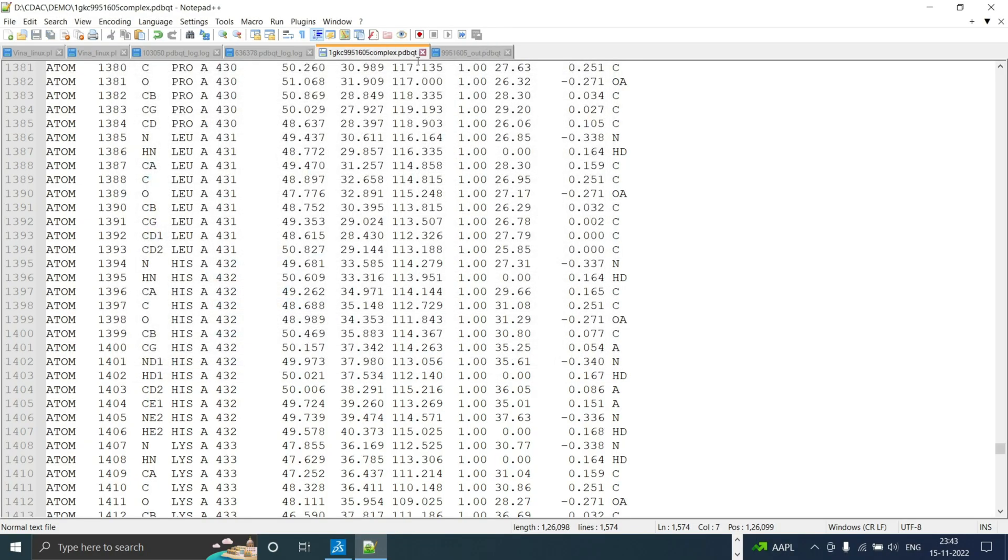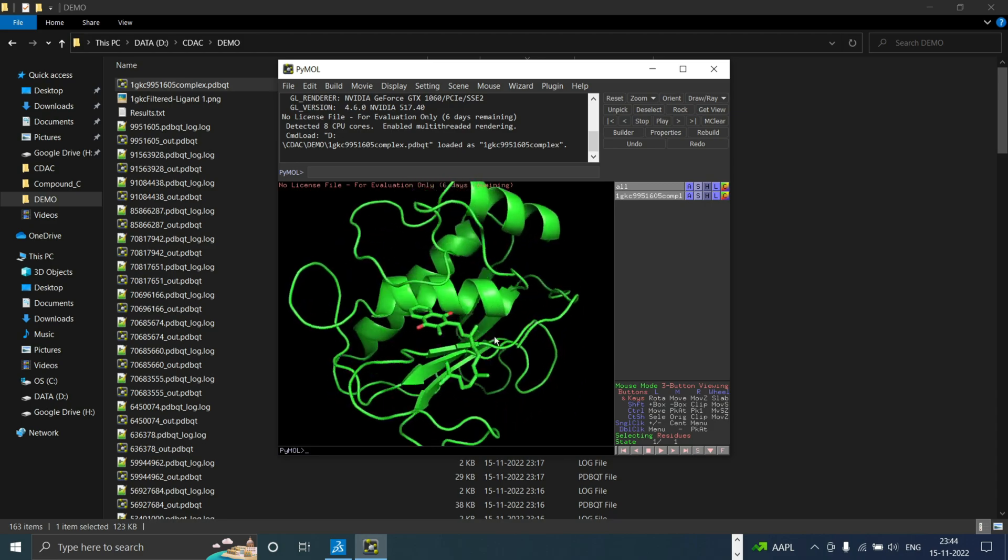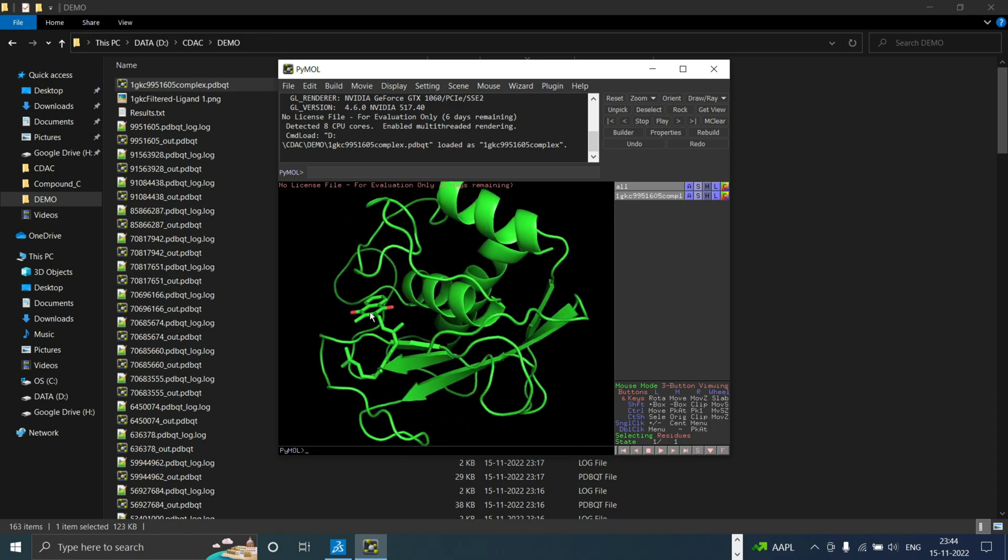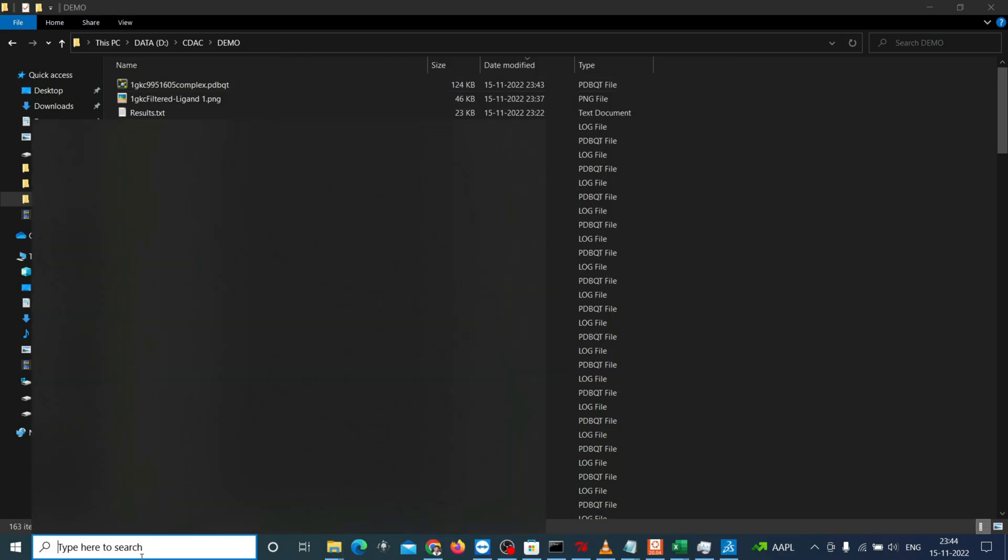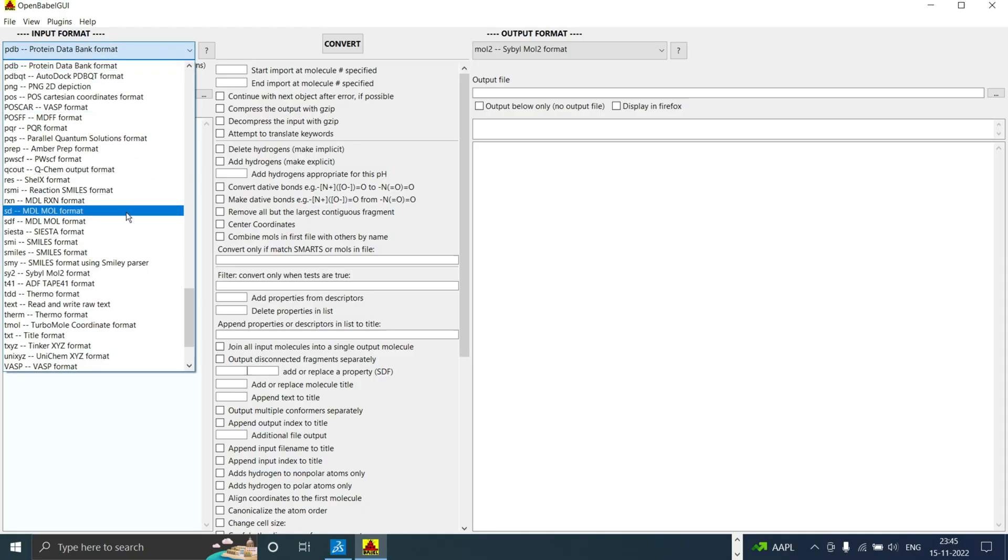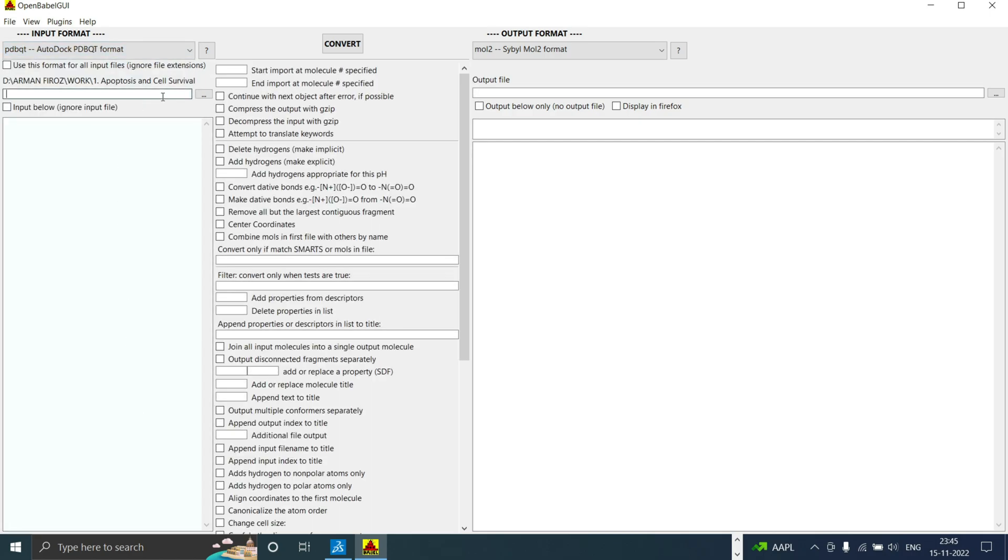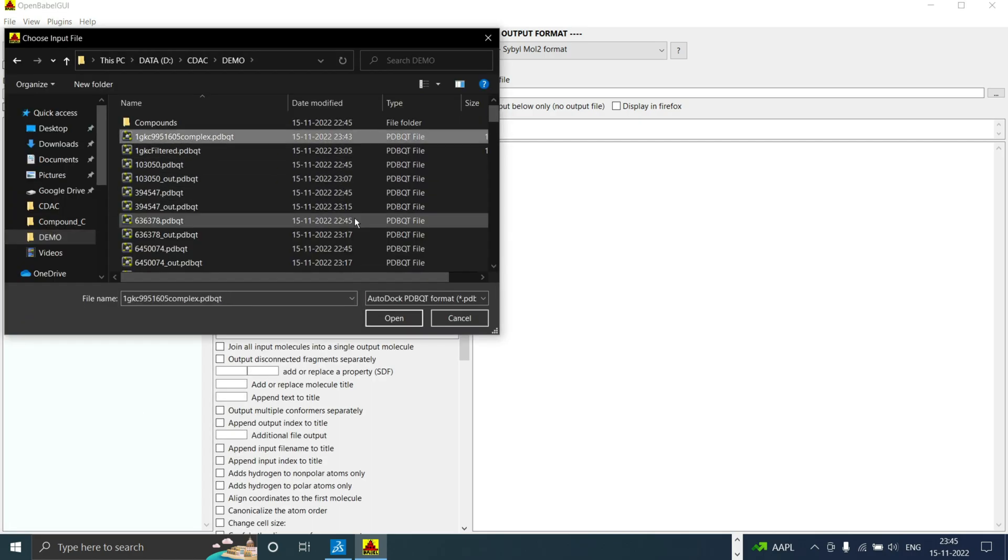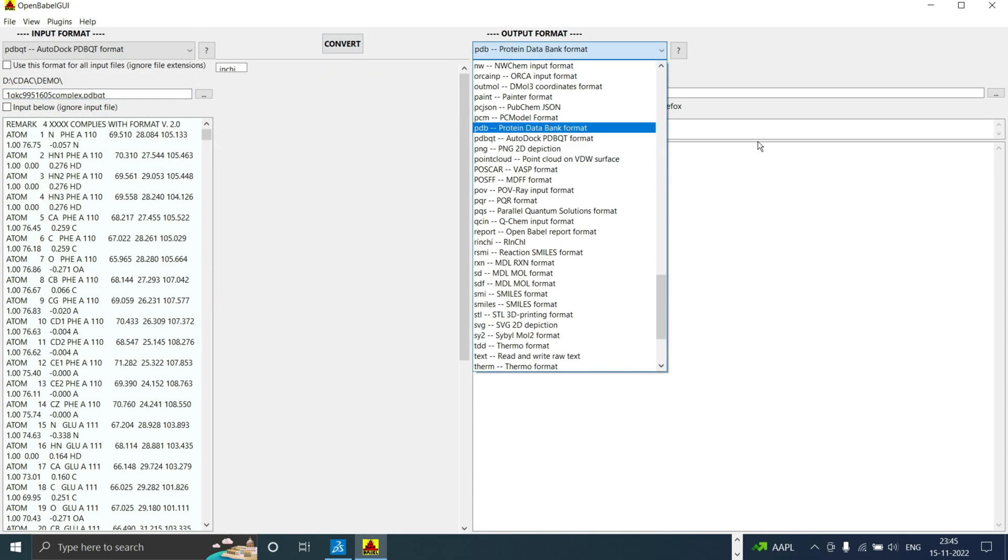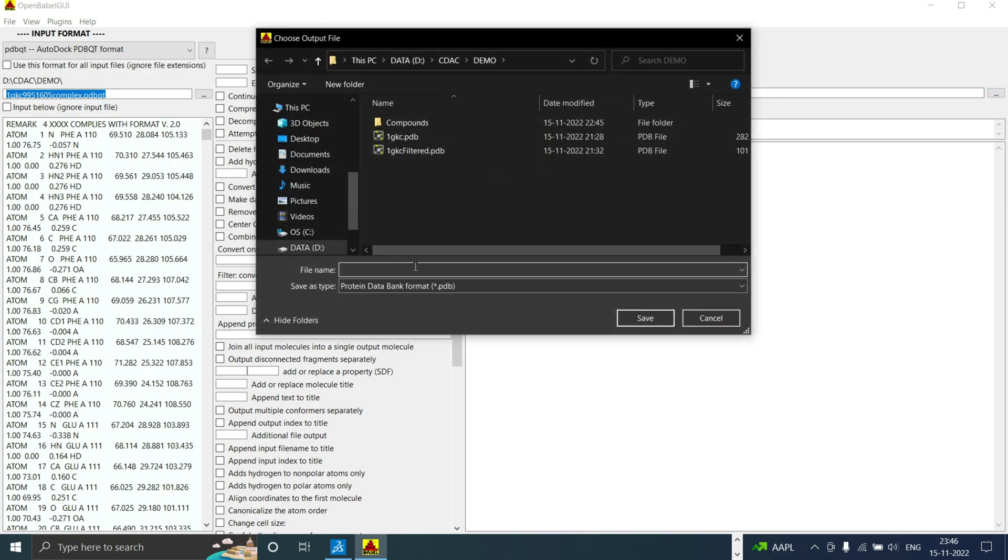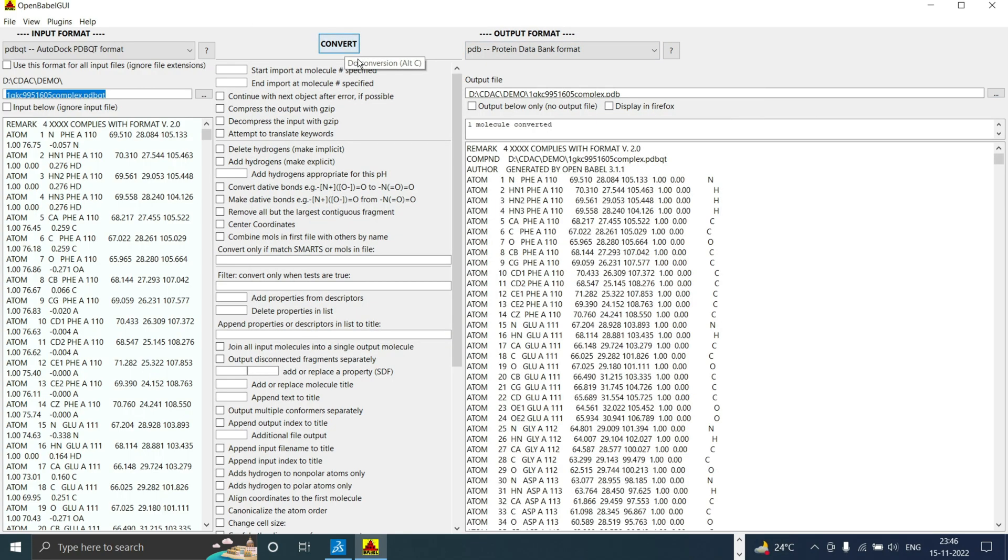Let's open it in PyMOL and see how does it look. Now we need to convert this PDBQT complex to PDB for PLIP analysis. We can use a software called OpenBabel for this conversion. Select the input and open the PDBQT file which you want to convert. Now we need to select the output file as PDB and name it as complex.pdb and click on save. Now click on convert.